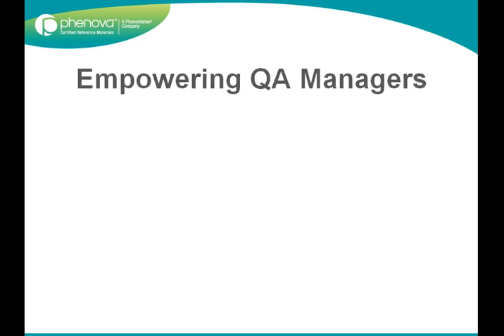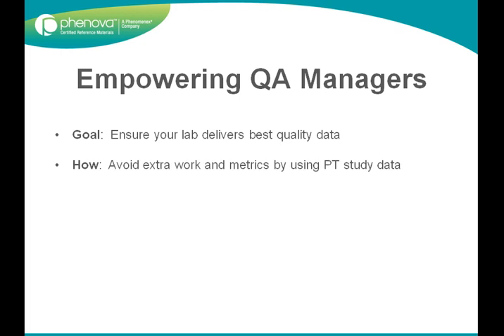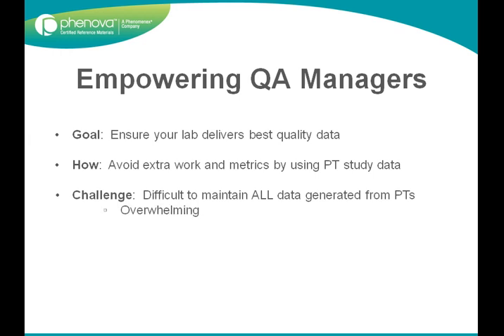Because as a QA manager, your everyday responsibility is to ensure that your lab is delivering the best quality data possible. And a great way to track this performance while avoiding extra work and additional metrics is to use the PT study data that you're already submitting. But it's typically a huge headache to maintain all the data generated from PT studies. It's overwhelming and extremely cumbersome to organize all the various spreadsheets.